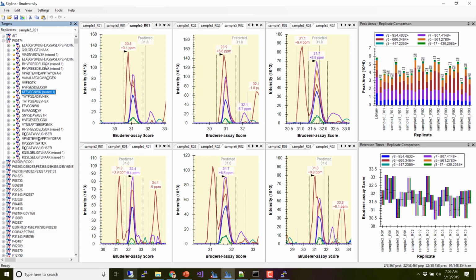It's another peptide, right? Just as the peptides we're targeting have these really consistent properties, they show up at the same retention time, well, that's the same for other peptides. So if I'm getting interference from another peptide, it's going to show up pretty consistently and cause me interference a lot, but it's also not perfectly consistent, so it's kind of moving around.